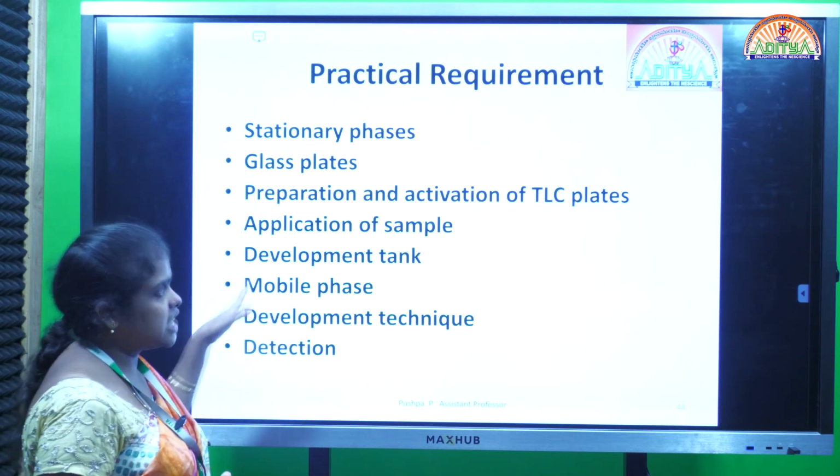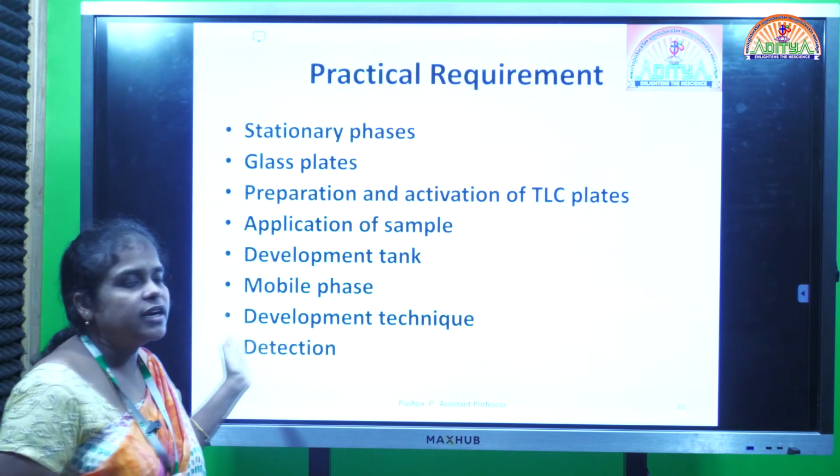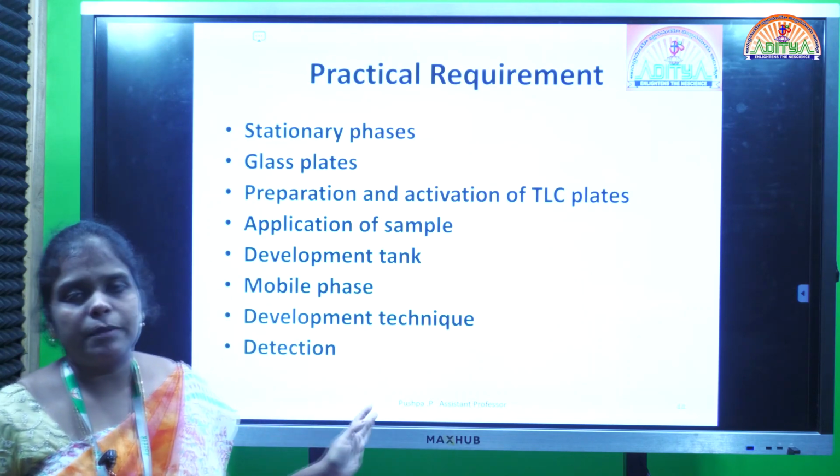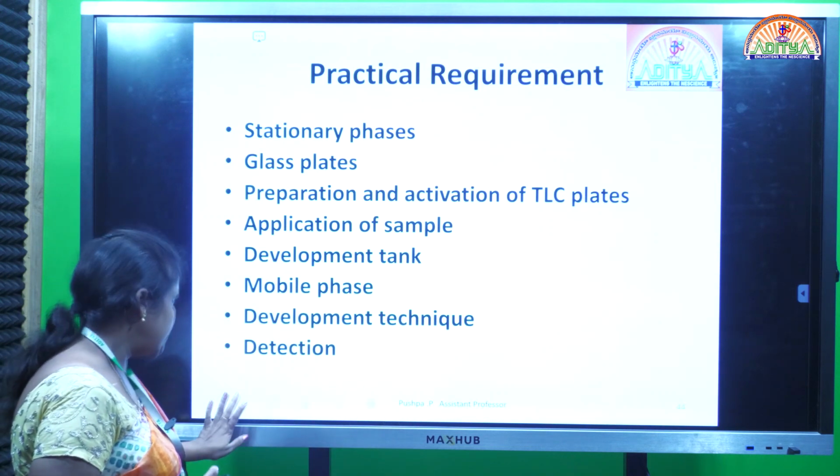These are the different steps in TLC, and not only these, there are different requirements for the experimentation part of TLC. So we will see each one by one.